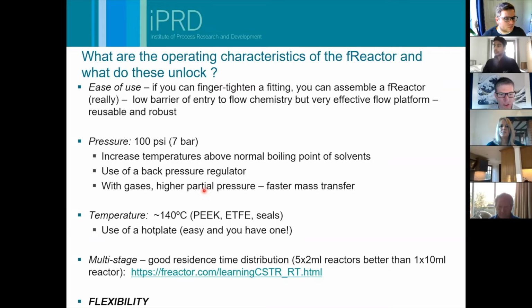And if we've got gases in there, so if we're doing gas-liquid reactions, then by pressurizing the gas, we end up with a higher partial pressure. That means there's a faster mass transfer from our gas phase into our liquid phase. So that's something about pressure.